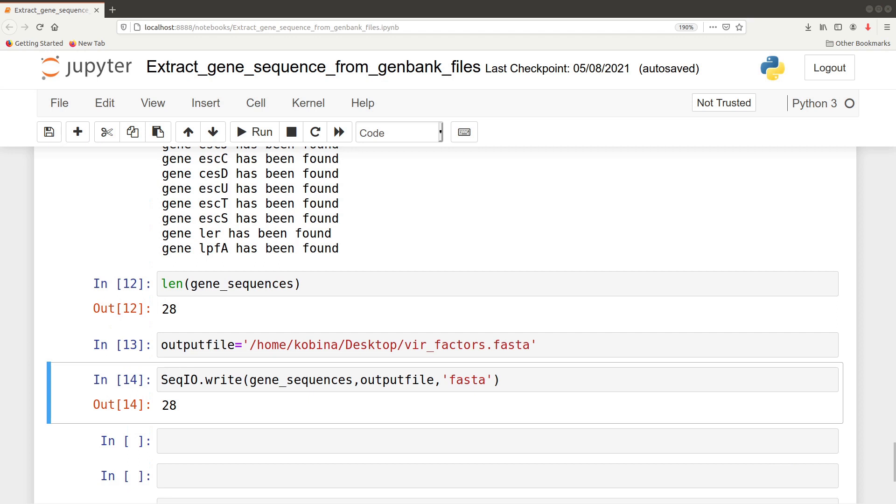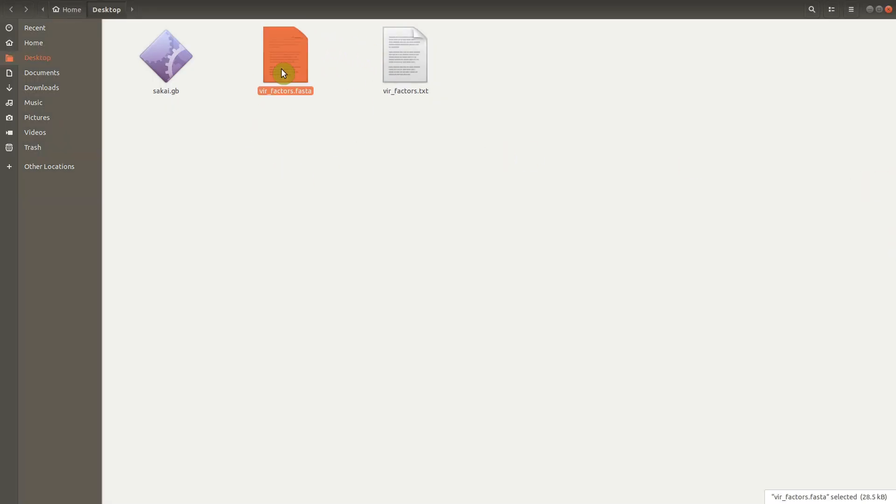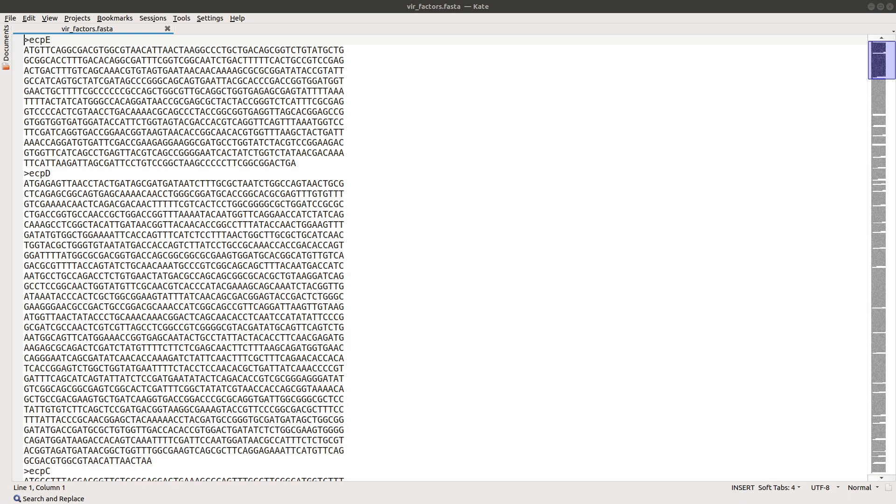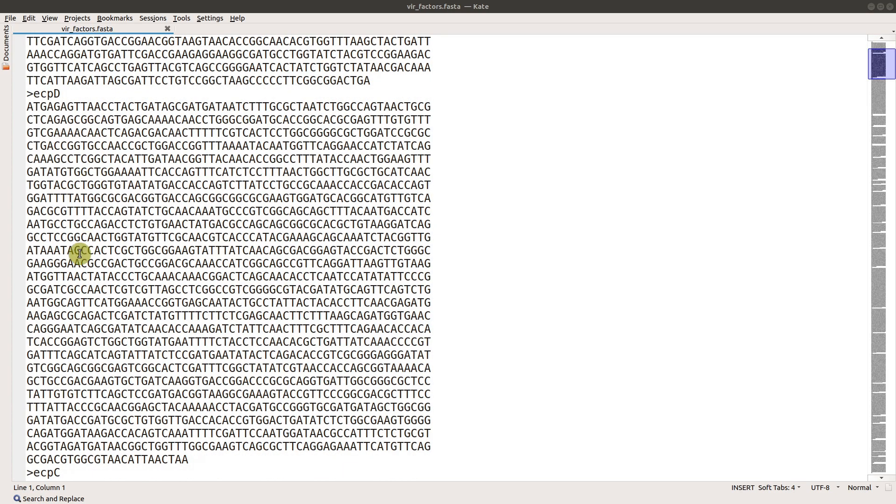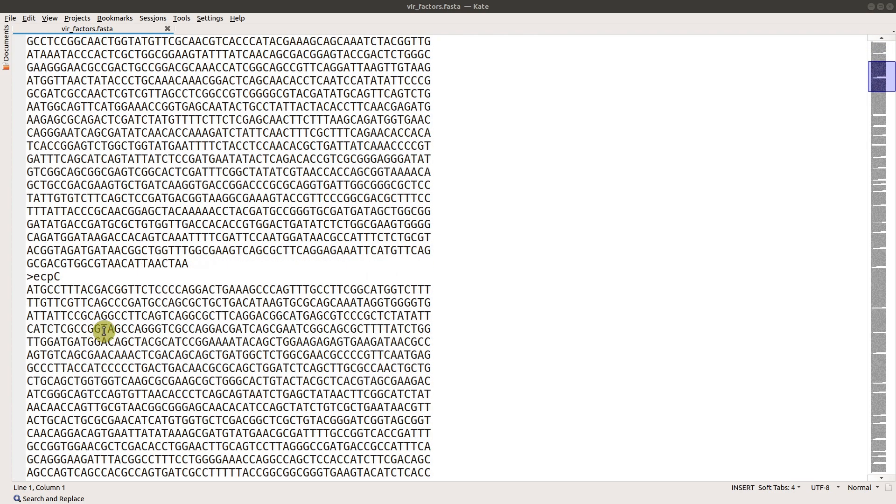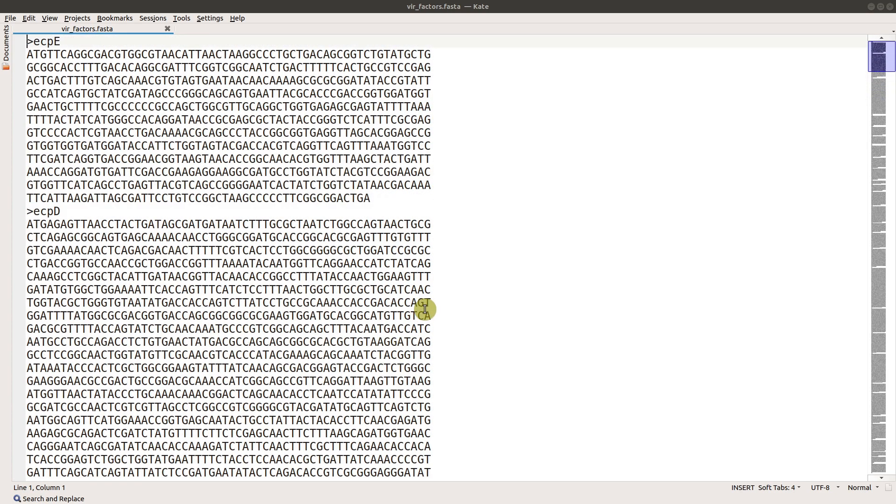Now let's quickly go to the desktop where we saved it to check the file out. This is the file that we have here. Let's open it to check the contents. There's the content of the file that we saved. Notice we have each of these genes and their sequences saved here. This is how we extract the sequences from here. From here, there are a number of things you can do depending on your research question - you might want to do some phylogenetic analysis or other calculations.